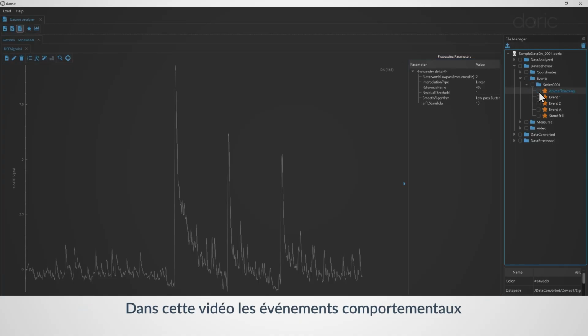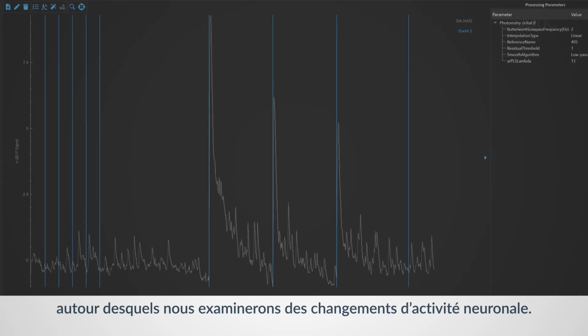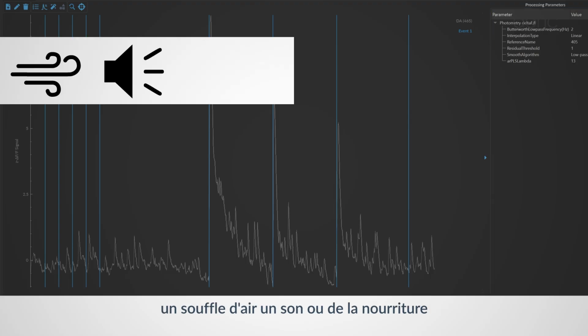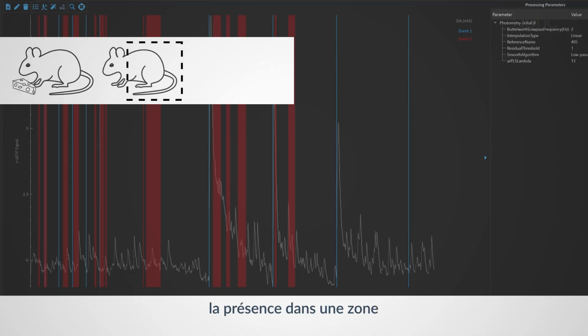In this video, behavior events refer to repeated timestamps around which we will examine changes in neural activity. These events can be the arrival of a stimulus like air puffs, tones, or food, or the animal's behavior response like consumption, presence in zone, lever presses, etc.